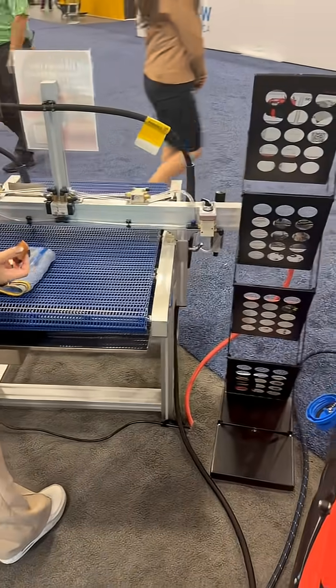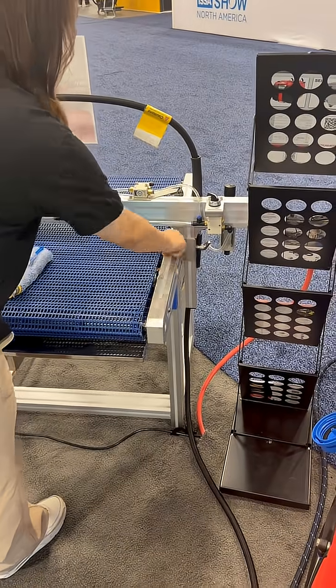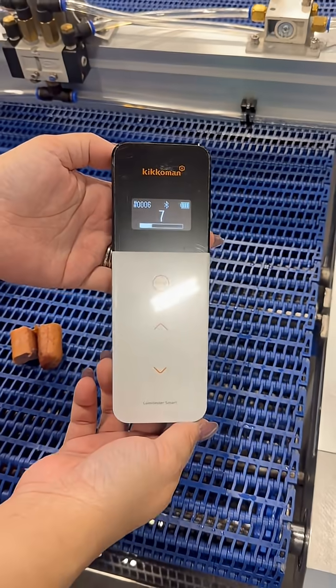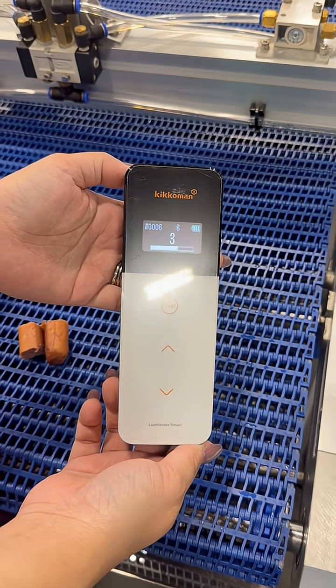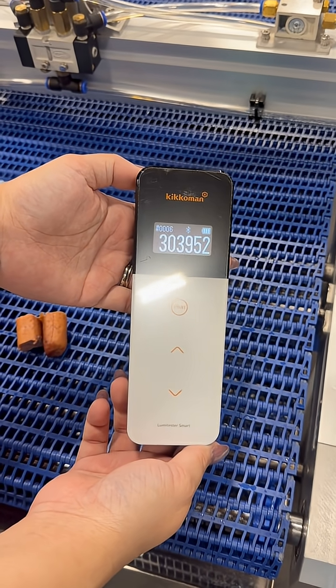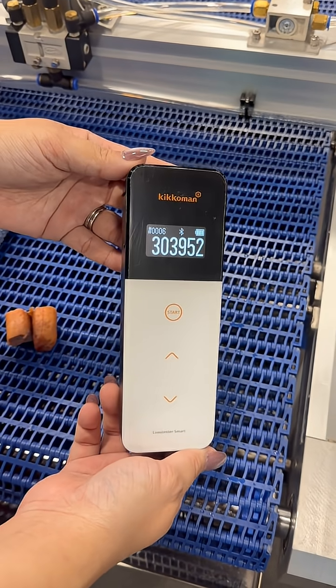At the ISSA show, we're going to do an ATP test on some aluminum. That's a really high number — 303,952.